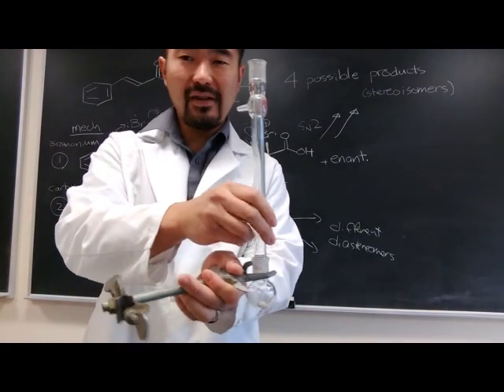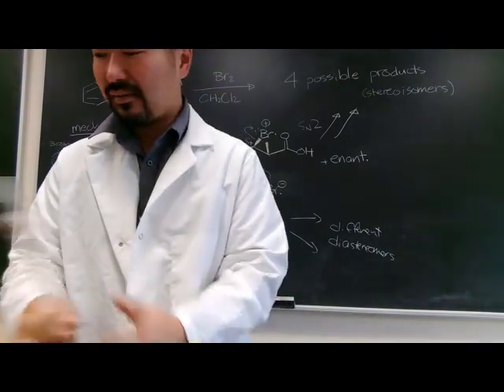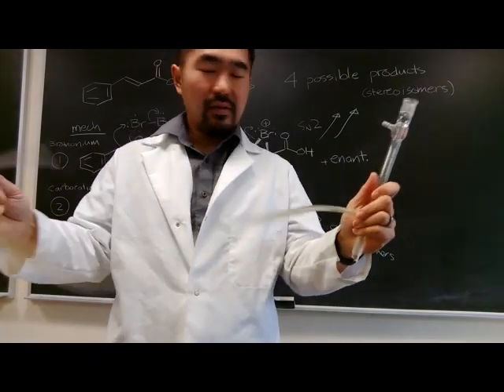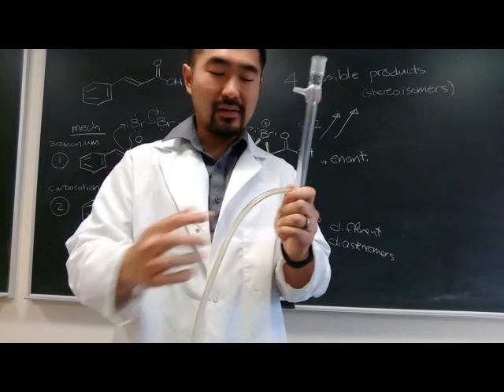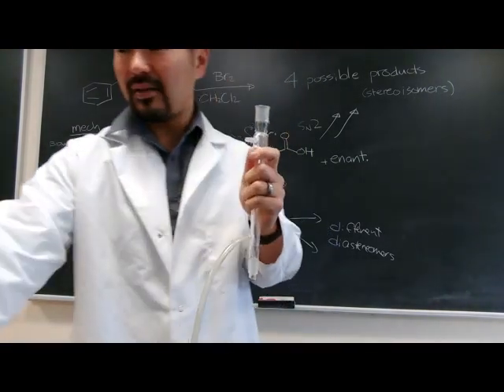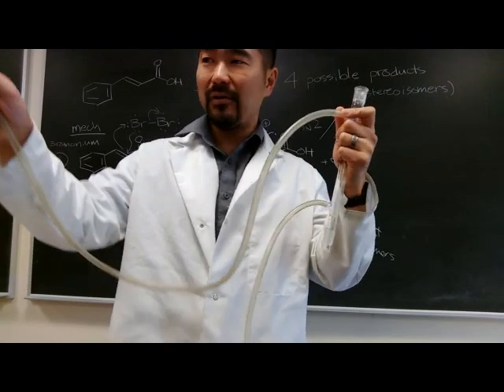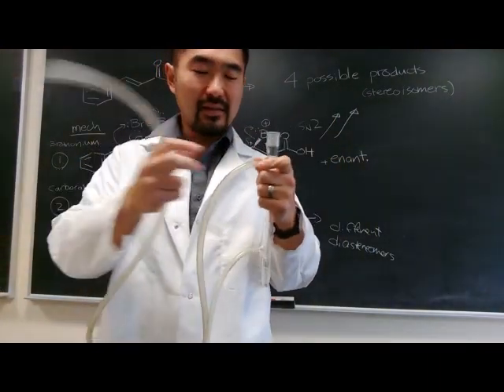Now, before actually placing the condenser though, you will want to take care of the plumbing. In the plumbing, your water inlet should be at the bottom of the condenser. In other words, water comes in from the bottom and fills up and goes out the top, and then the line from the top will go into the waste or little sink that there is inside the fume hood.